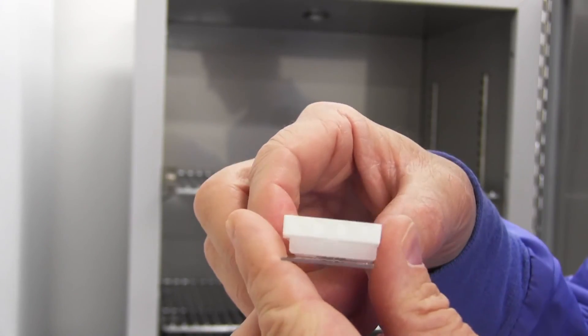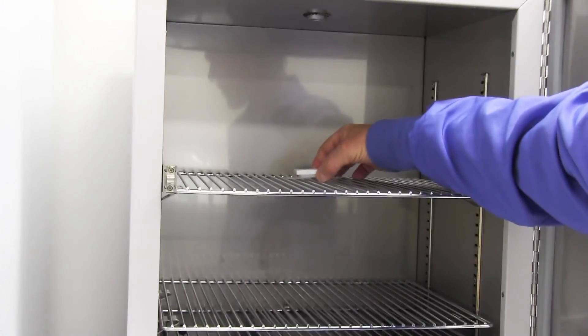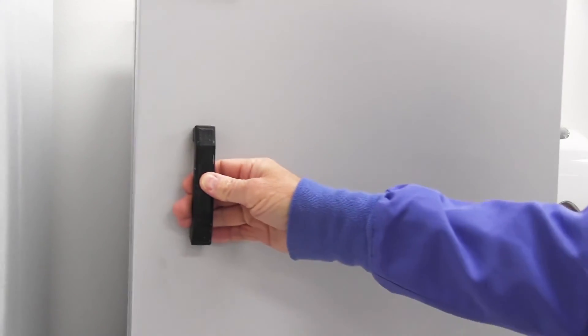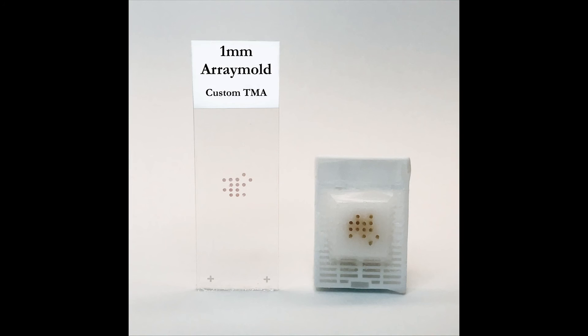Once you have filled the holes with tissue and paraffin you will need to set your punches. Setting a TMA block is covered in several of our videos including our up and running TMA video.